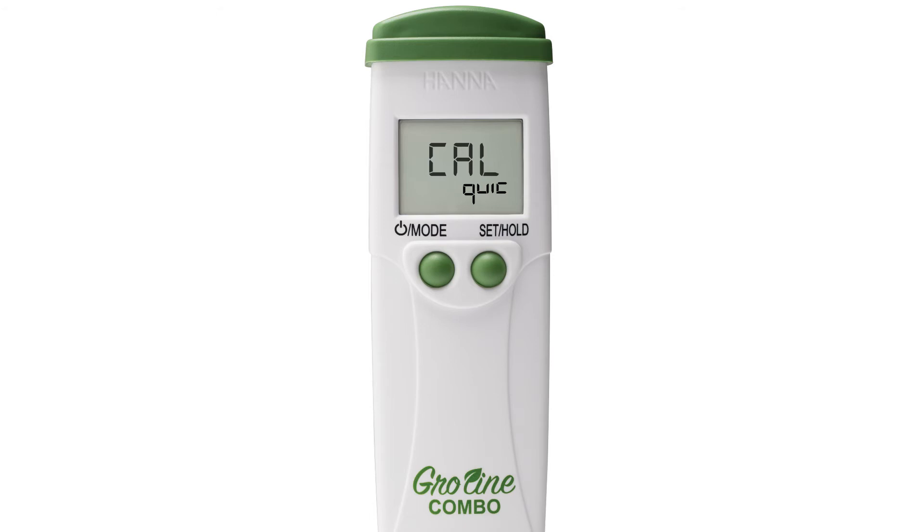Once you have your calibration type, press the mode button again to choose your temperature settings. By pressing the set hold button you will see the temperature units change from Celsius to Fahrenheit. Press mode again and you can now choose your auto-off setting.